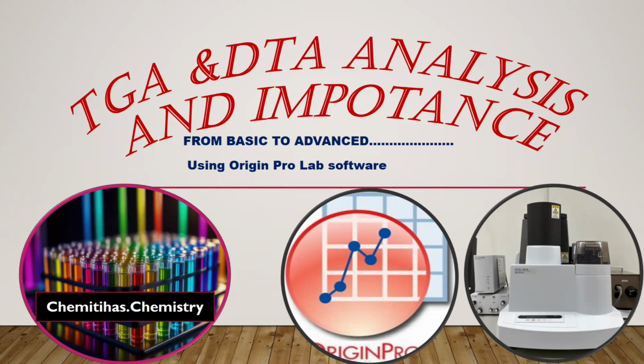I'm going to explain how we will be able to analyze the TGA graph or plot using our Origin Pro Lab software. Before that, I think we should discuss what TGA and DTA are and why we material chemists need them. First of all, I will discuss the details of it. Then I will show you a plot, how you can insert the data, and the most necessary part of the analysis, followed by that.